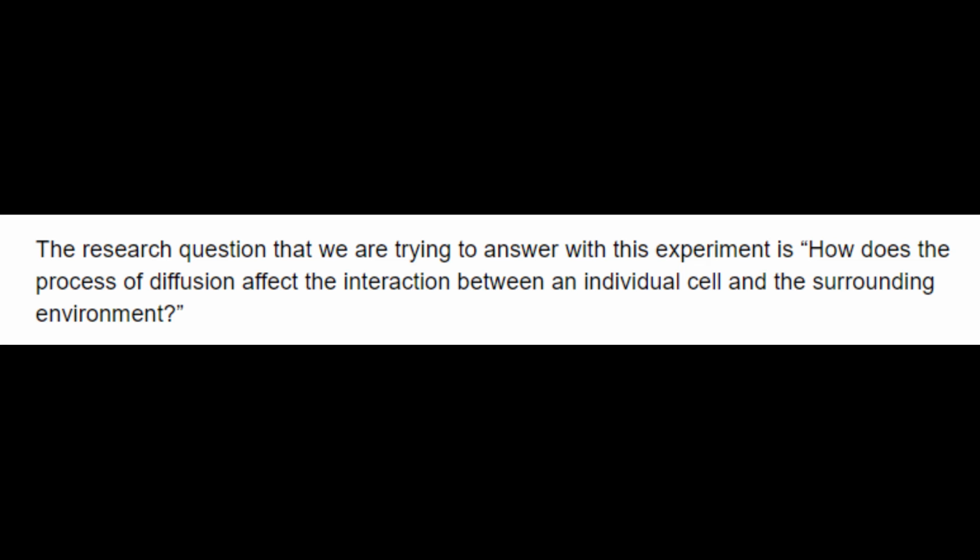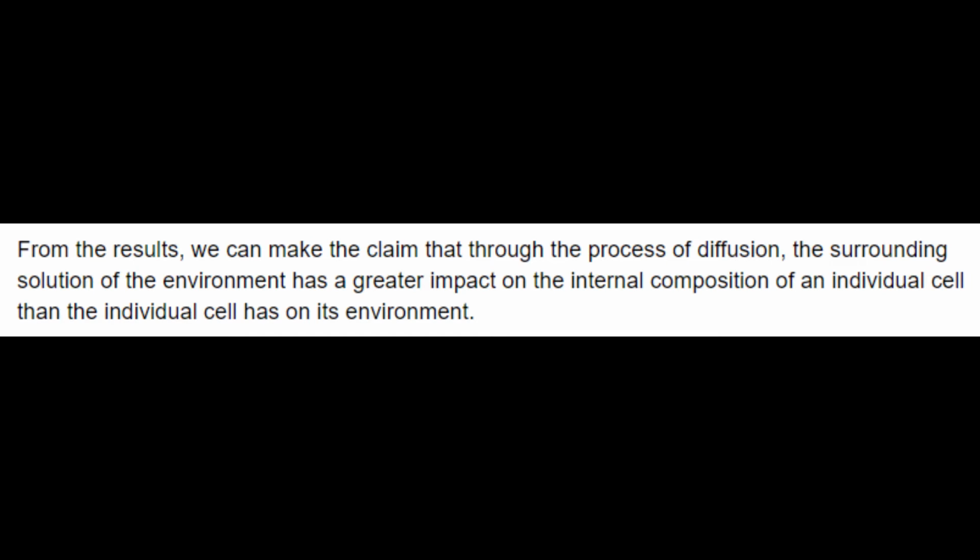The research question that we are trying to answer with this experiment is, how does the process of diffusion affect the interaction between an individual cell and the surrounding environment? From the results, we can make the claim that through the process of diffusion, the surrounding solution of the environment has a greater impact on the internal composition of an individual cell than the individual cell has on its environment.